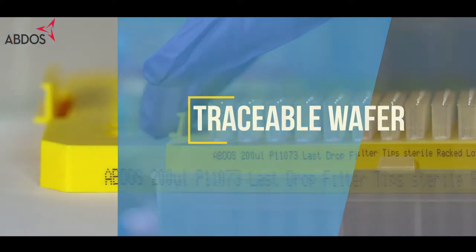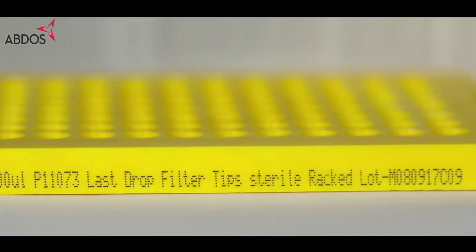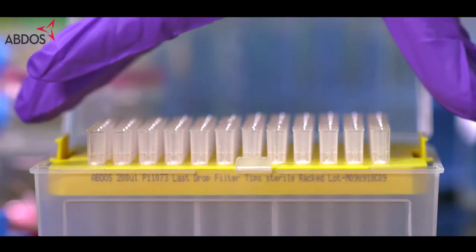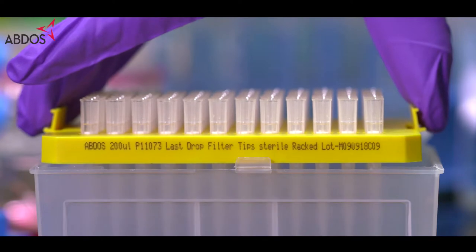Each wafer of the rack is printed with the effective volume range and a lot number with product code, making it easy to keep your work organized and ensure supplies are traceable.